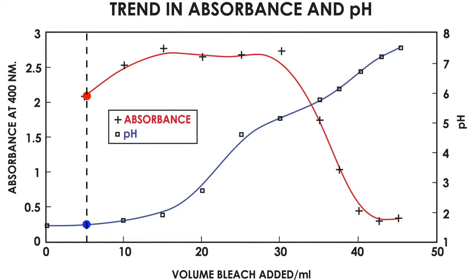The first part of this video demonstrates batch activation of HB2, where two things are going to happen at the same time. The red line is going to trace the absorbance or colour intensity of the solution during the activation process, and the blue line traces the pH swing. We will go over this graph slower and in more detail during the next part of this demonstration.